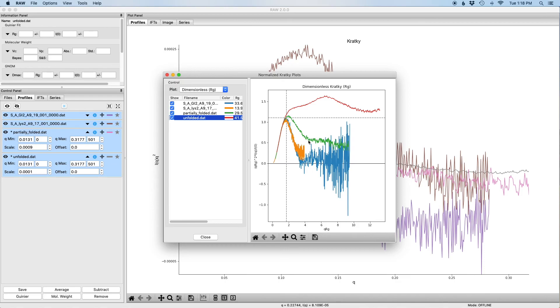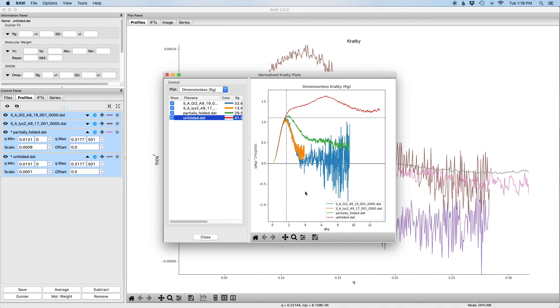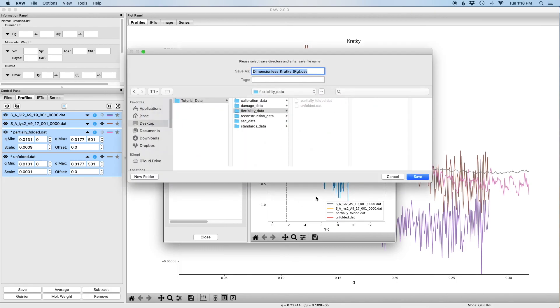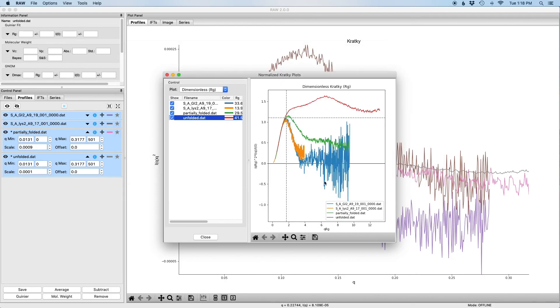So that's what the dimensionless Kratky plot in RAW does. The one other thing I'll mention is that if you right-click on this plot, you have some options. You can add a legend if you want and you can export the data as a CSV. So if you don't want to have to do the transformation yourself when you're making your plots, if you click on this, you can export all the data.